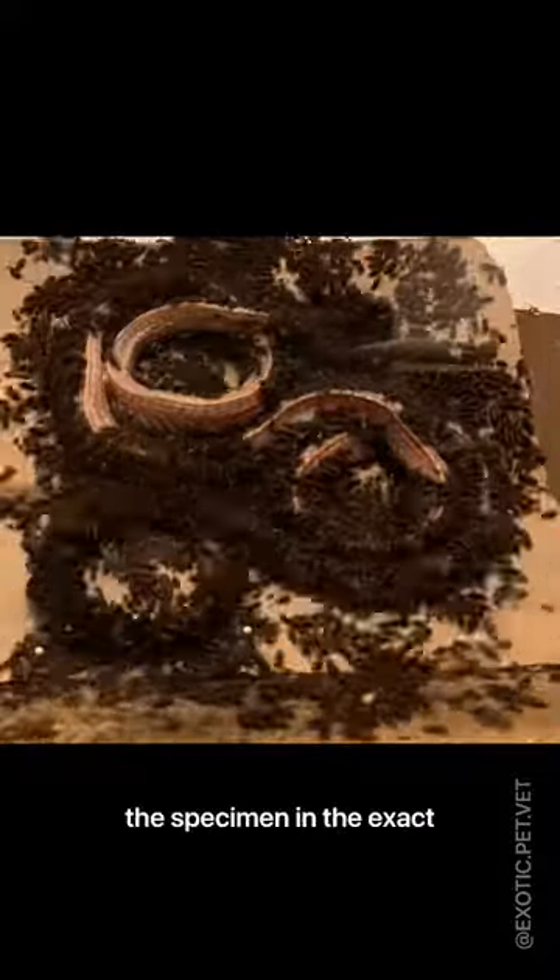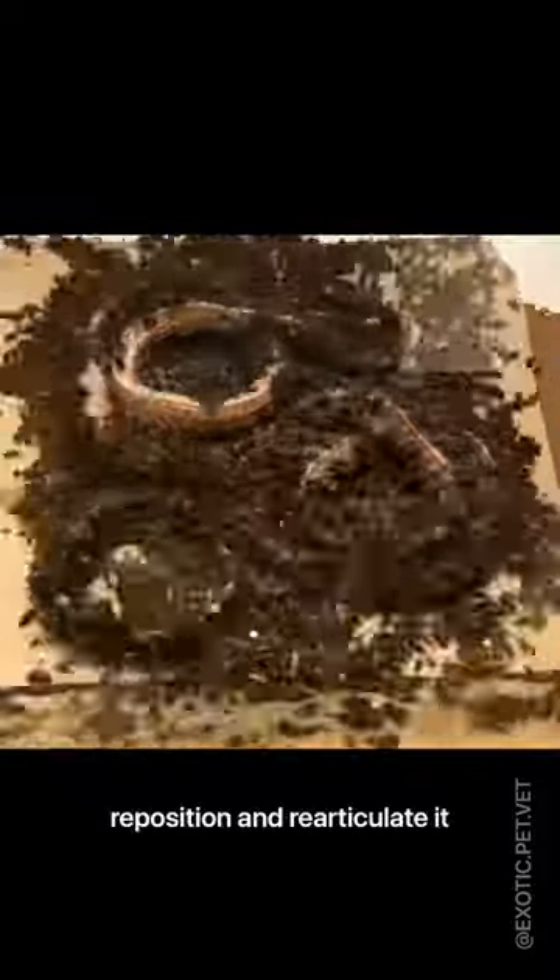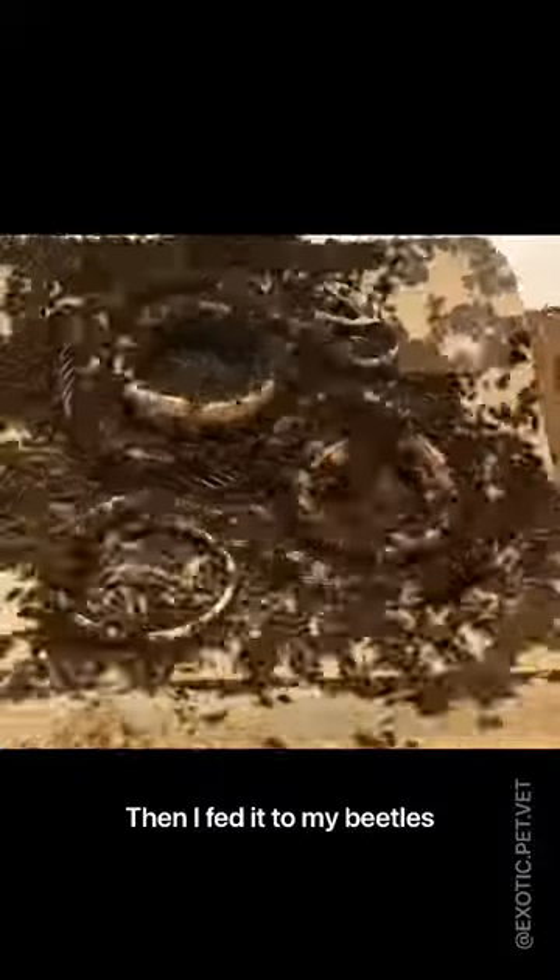This dehydrated the specimen in the exact position I wanted it to be cleaned in, so that I would not have to reposition and re-articulate it afterwards. Then I fed it to my beetles, which cleaned it in about a day and a half during this time lapse.